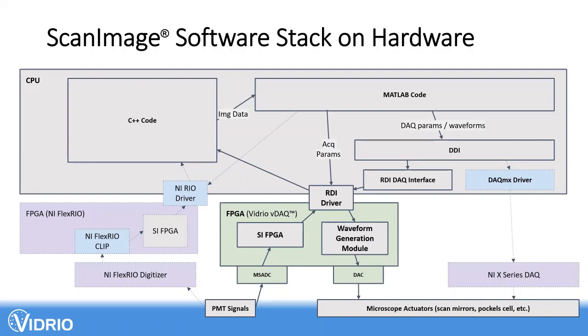And this is one of the other limitations of the NI hardware, is that the communication between the FPGA and the DAQ boards has to go through a backplane, and there's a limited number of channels, and there are limitations on the speed and a variety of other issues. And with the vDAQ, we got rid of all of that. It's all on the same board, and you've got immediate interaction between the FPGA and the analog outputs and analog inputs, et cetera. So we felt this was really necessary to get to these types of closed loop things that people were going towards in the future.